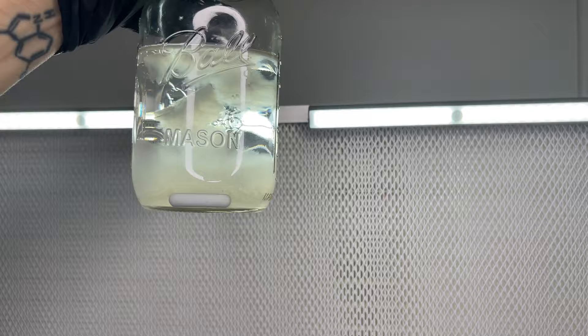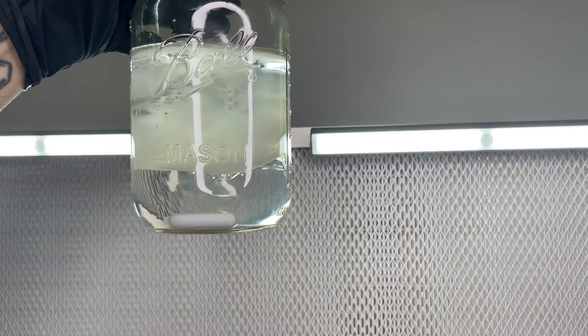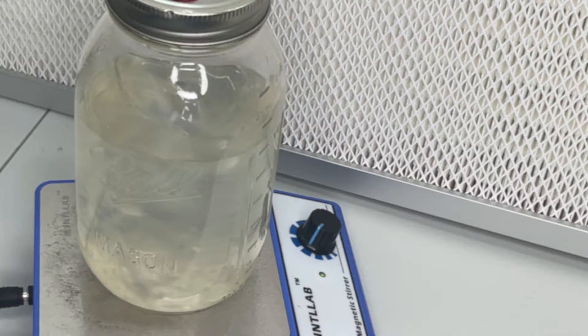If the mycelium starts growing on the surface of the liquid culture, make sure to use the magnetic stir bar every day, or else the mycelium will form a pellicle on the surface, which will make it hard to make into syringes.